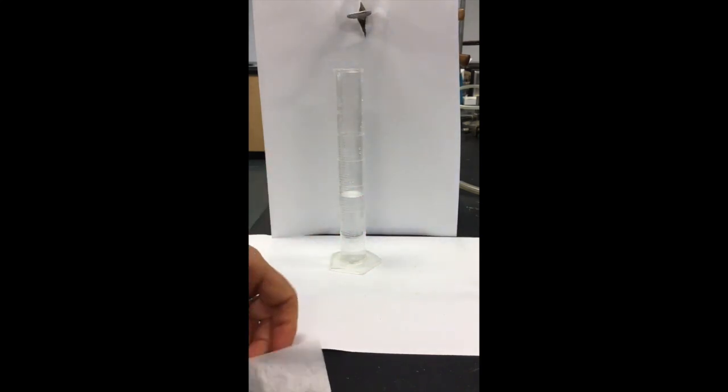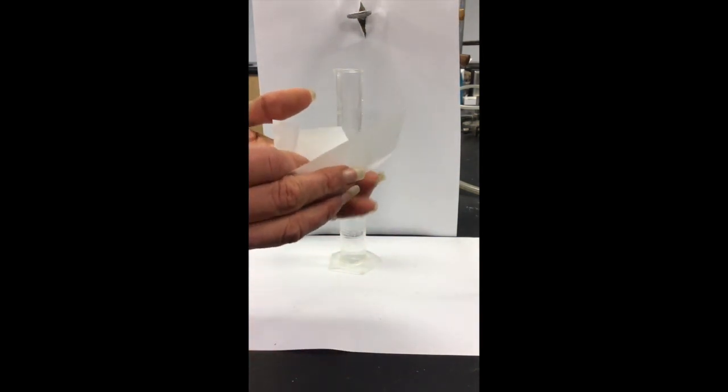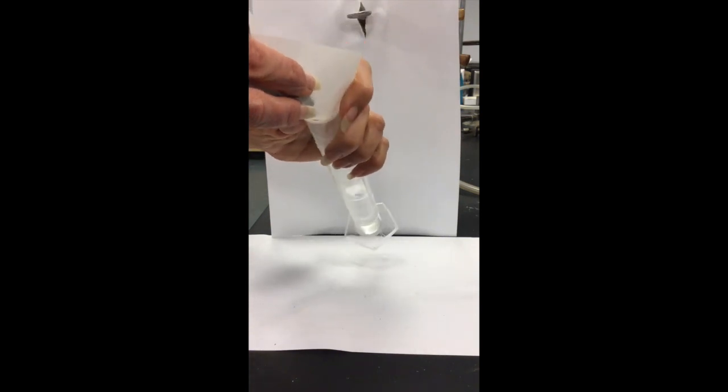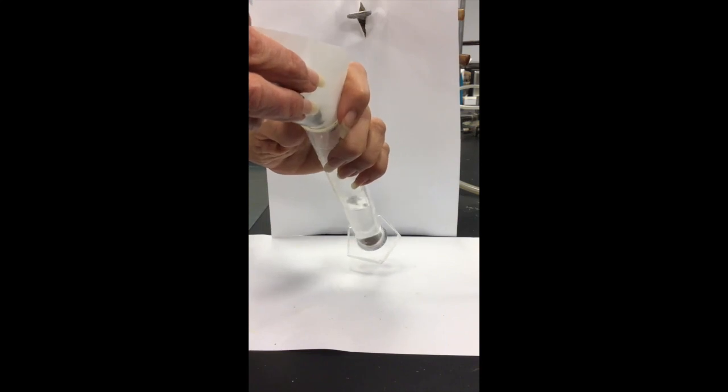Now what we're going to do is transfer our gravel into the graduated cylinder. I want to do this at an angle so that I add it in slowly and don't splash any of the water out.